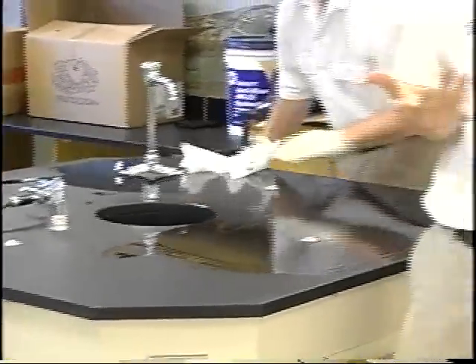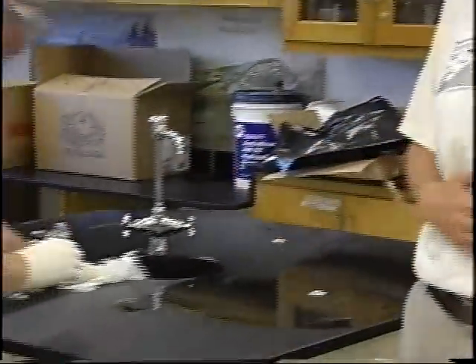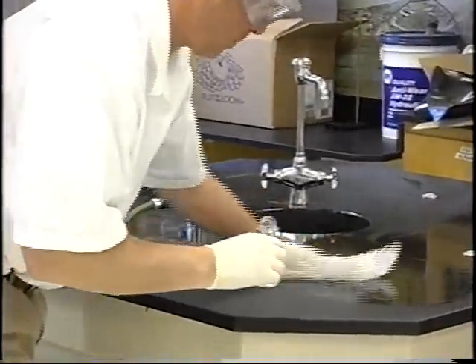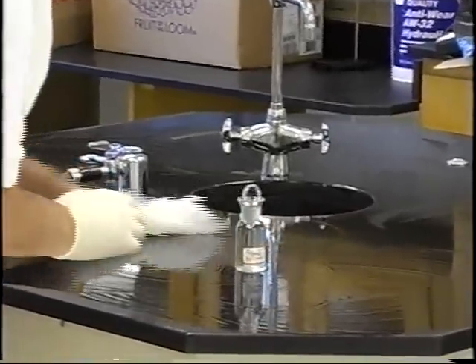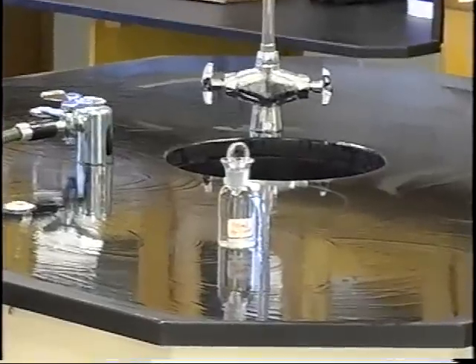The equipment we're using, the graduated cylinders and all the glassware that's been put in an autoclave, all the bacteria on that glassware has been killed. The bottle here, which I'm not touching since I'm not geared up yet, was also autoclaved, so there is almost no chance that there's anything else in that bottle except bacteria from the river.